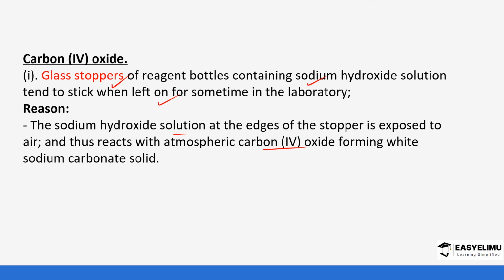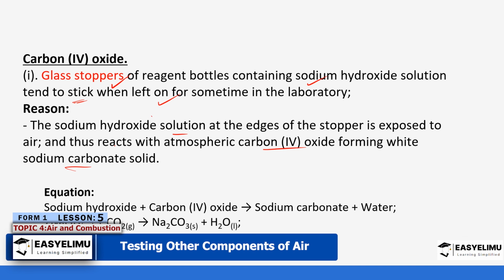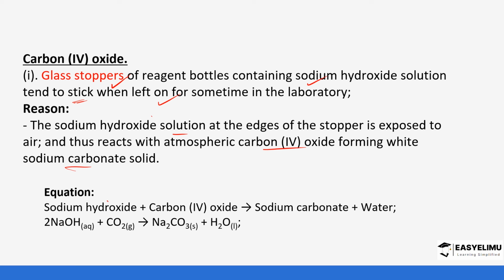When it reacts with carbon dioxide, it forms the solid sodium carbonate. Then this solid sodium carbonate is the one that causes the stoppers to stick because it's holding on to them. So the equation for the reaction is sodium hydroxide reacts with carbon dioxide to form sodium carbonate and water.